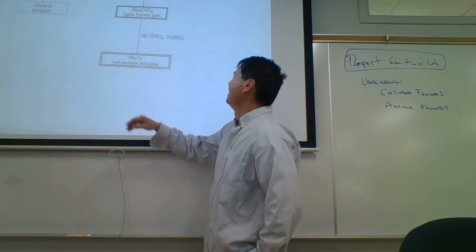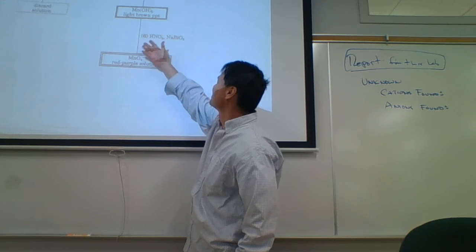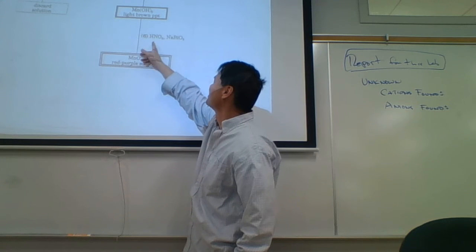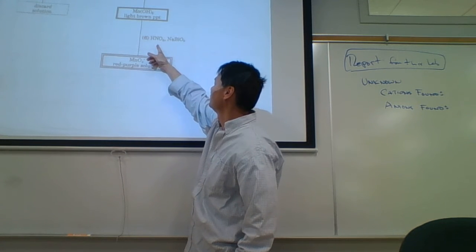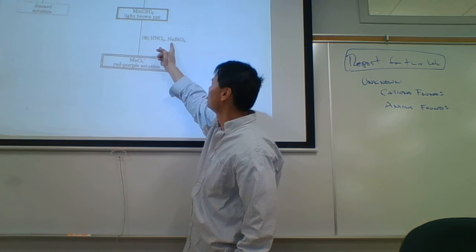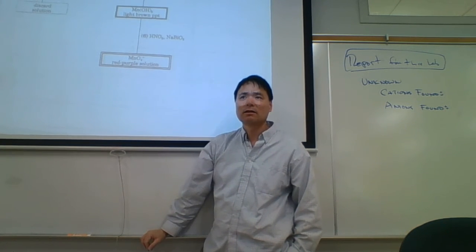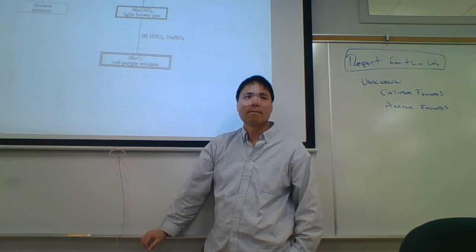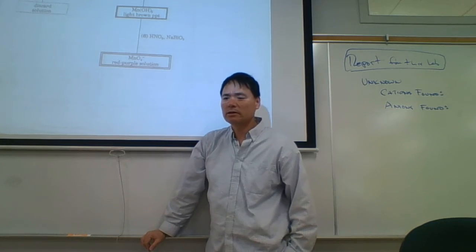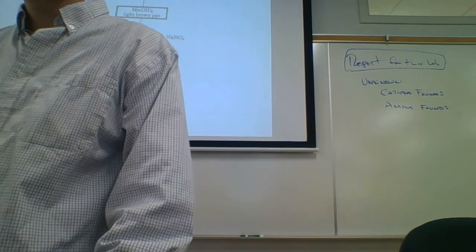All right, again, this step you've got to watch out for. If we get this light brown precipitate, we're going to dissolve it in some nitric acid, and then add some of this solid. What is this? This is called sodium bismutate. What do you know about sodium bismutate? Does anybody know something about sodium bismutate from last time?